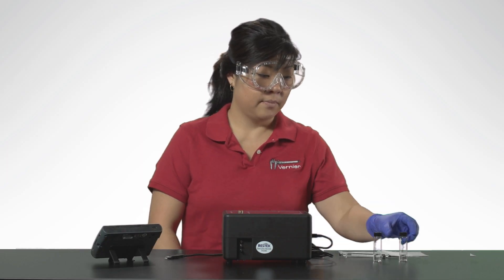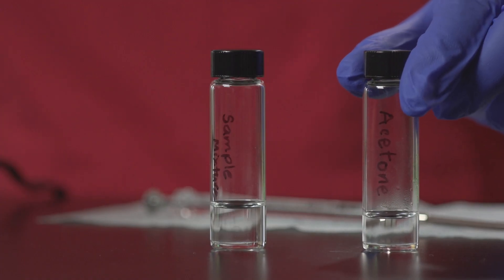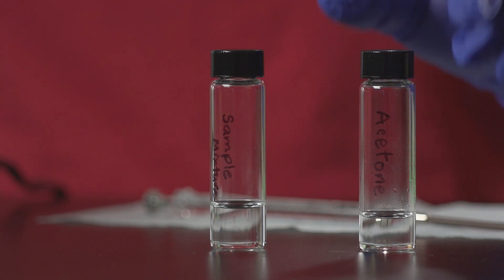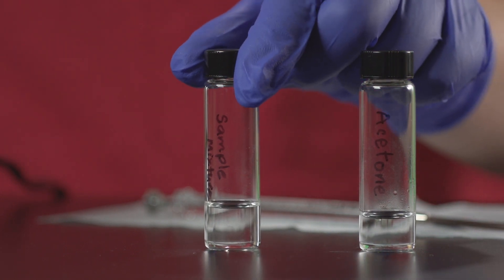A Hamilton 1 µL syringe is included with the Mini-GC Plus. This rinse vial contains acetone. The sample is a 1 to 1 mixture of ethanol and 2-butanone.